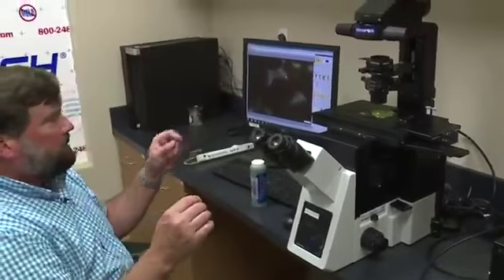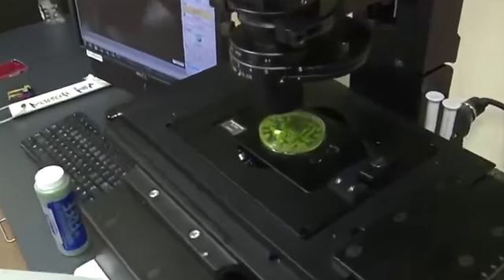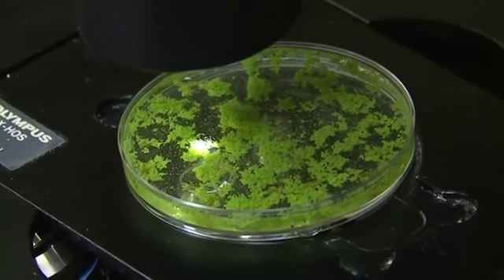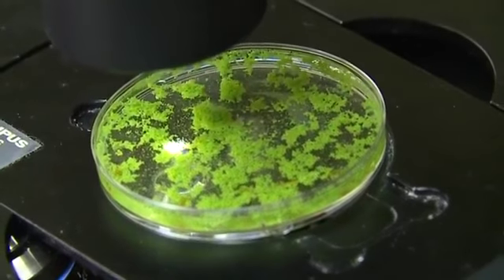We are seeing some, if you just look at it under the Petri dish here, you do see some of that bright green, bluish green color still. So there are still some living cells in here. We may be seeing some die and others still growing, and so it may linger longer than just everything dying.